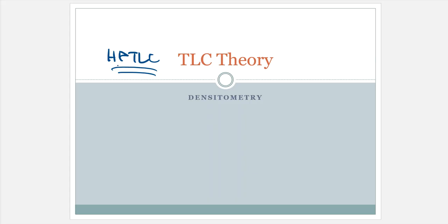And I see the word density in here, right? Density is like how heavy. That's what most people think of most of the time, even though that's not really the proper definition. They think of heaviness, like how heavy is something? Oh gosh, this has got a real big density, it's going to be sinking. Oh no, this density is pretty light and fluffy, it's just going to float on top of the water. Well, it's not quite what's happening here with HPTLC.